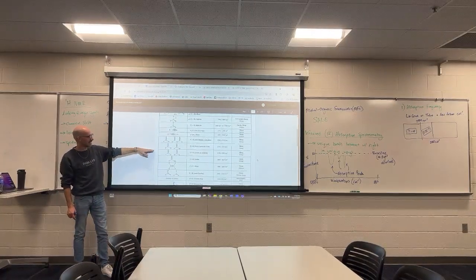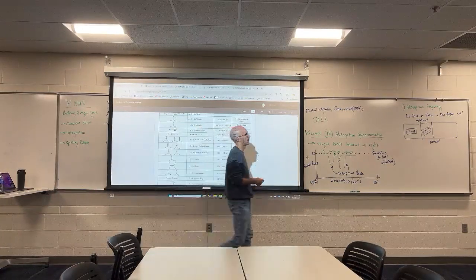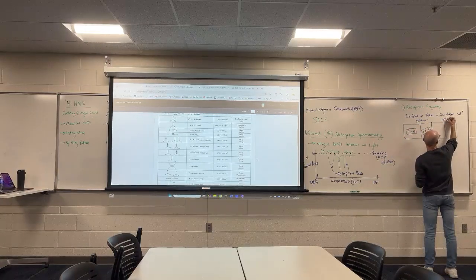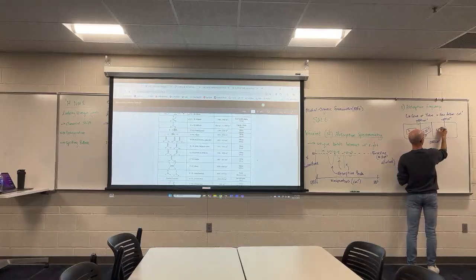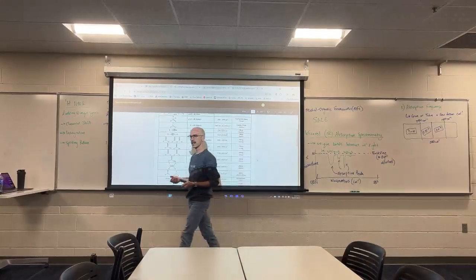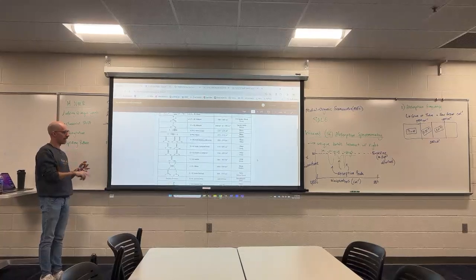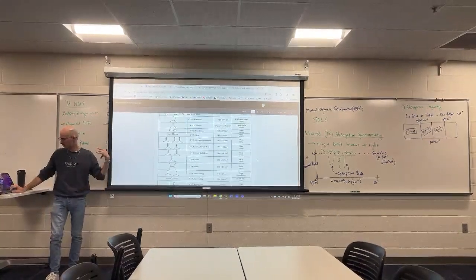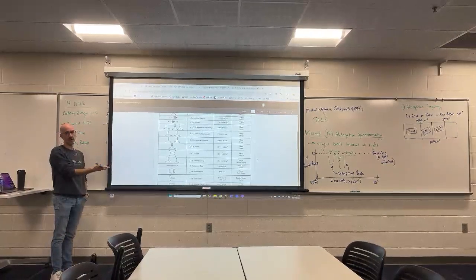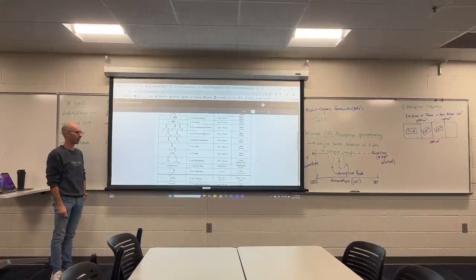Starting around 1900 and coming all the way down to 1600. Actually, I'm going to bring this line down to 1500. This is the double bond region. That's where carbon is often double bonded to another carbon. Carbon is double bonded to an oxygen. Or in the case of the research I was showing you, carbon double bonded to a nitrogen. I actually don't have the carbon-nitrogen double bond on here because it's not as common of an absorption. It's not something you look for as often.